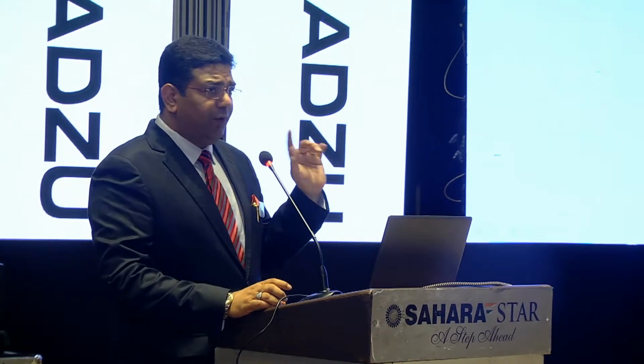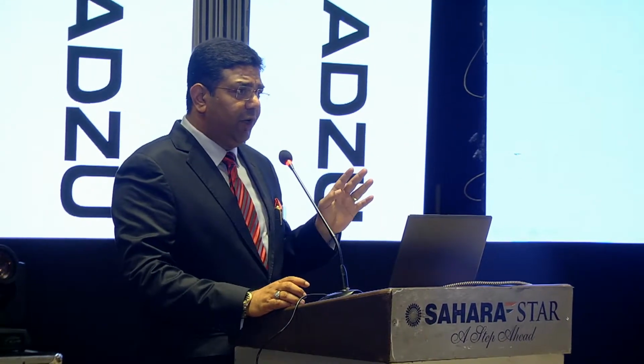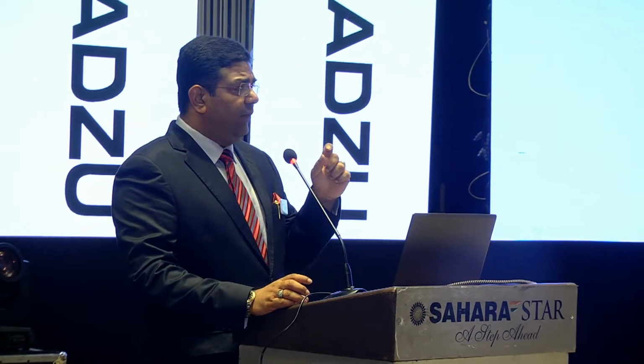Just one more announcement. The products we have introduced, AP, open altogether a new window. I'd like to share one small experience. We had one case last year with an FMCG company, Procter & Gamble. They wanted to buy 40 analytical balances, but they wanted computer connectivity.